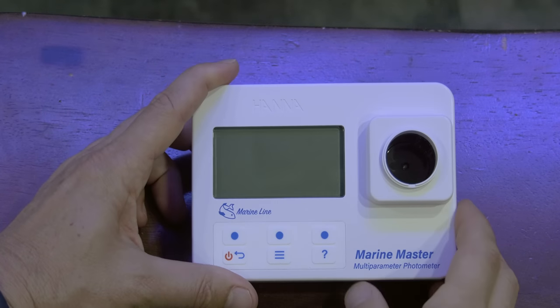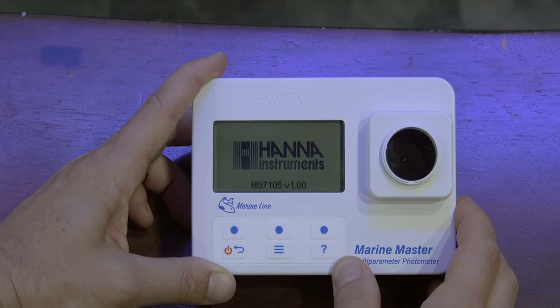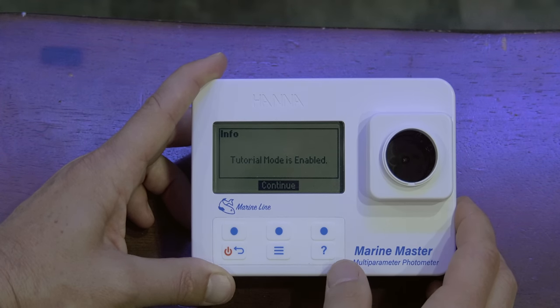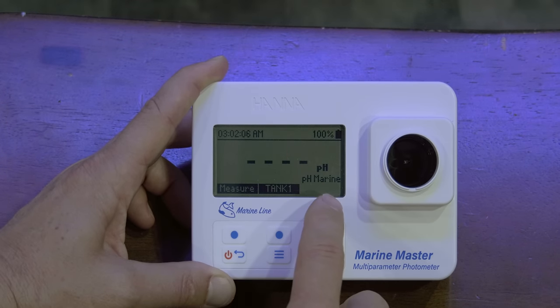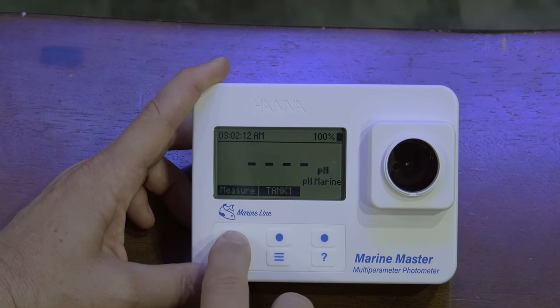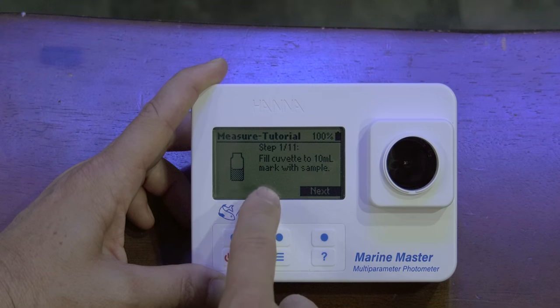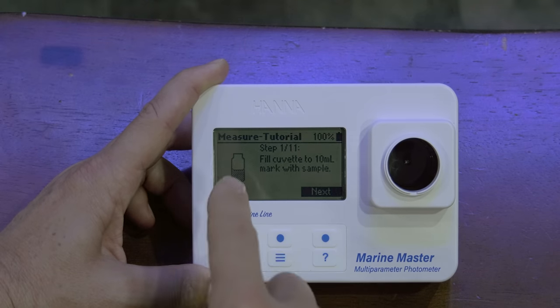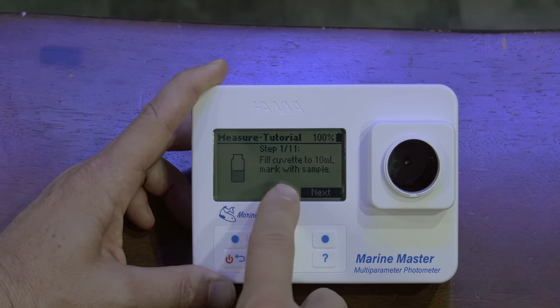Let's jump into this thing and fire it up. Looks like we have a splash screen — get this thing booted up. Tutorial mode enabled. Continue. Tank one, measure — and it's checking pH. I wanted to check pH and it just happened to roll straight into pH. Going to measure. Look at this — step one of eleven. So it's walking me through this and shows me what step I'm on. I like this. I don't have to wonder where I am in the process or if I skipped a step — it's showing me right on the screen.